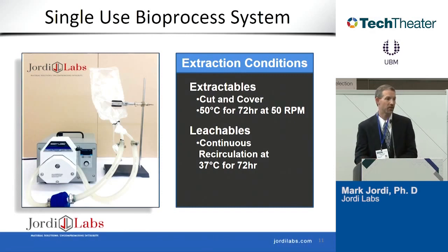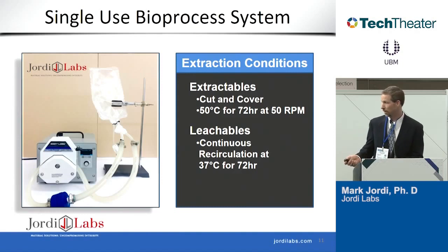These extractions were either conducted at 50C for 72 hours or 37C, the 50C being an exaggerated condition. So anything that we find under those conditions would be considered extractables. The 37C was done for our leachables condition to be similar to what you would expect the use condition to be.